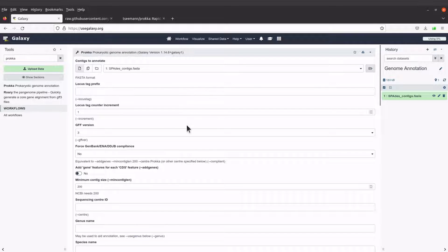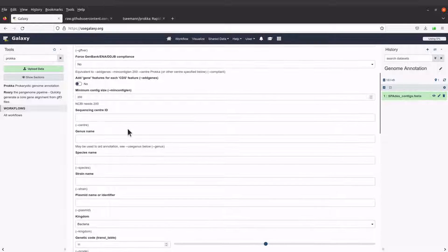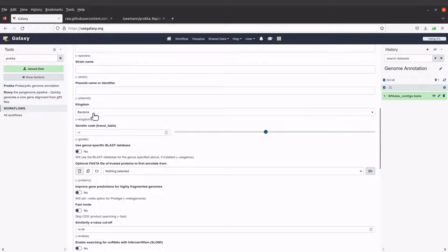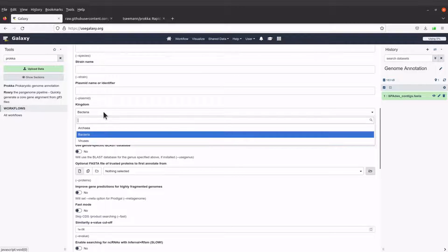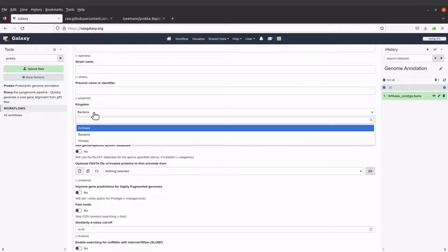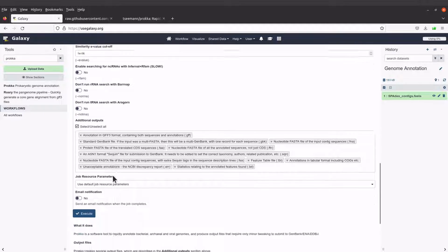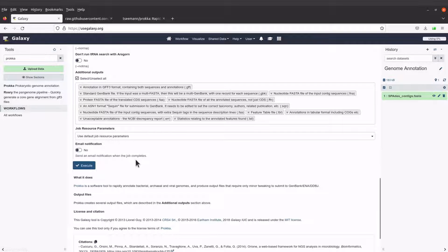A configuration window will come up. We will leave the filename/locus prefix as is, since Prokka can automatically generate one, though you can also enter your sample name. Since this is an intro video, I'd like us to avoid modifying most parameters. I will enable the option 'Add gene features for each CDS feature' by setting it to yes. Make sure the kingdom is set to Bacteria.